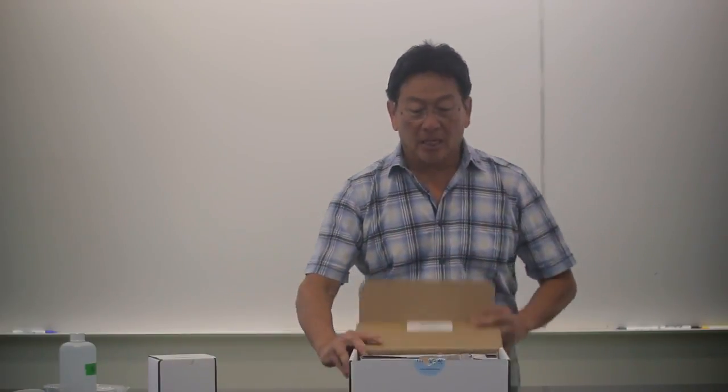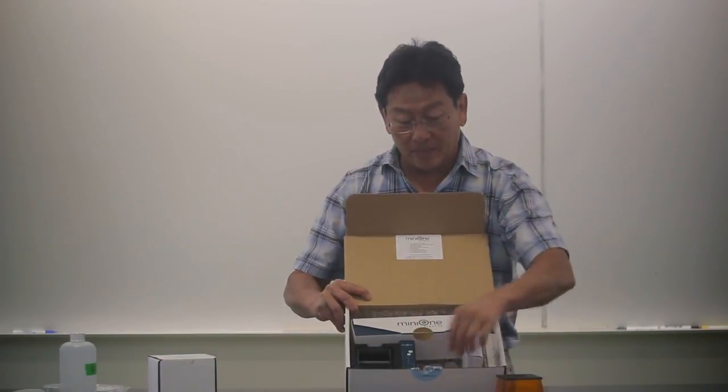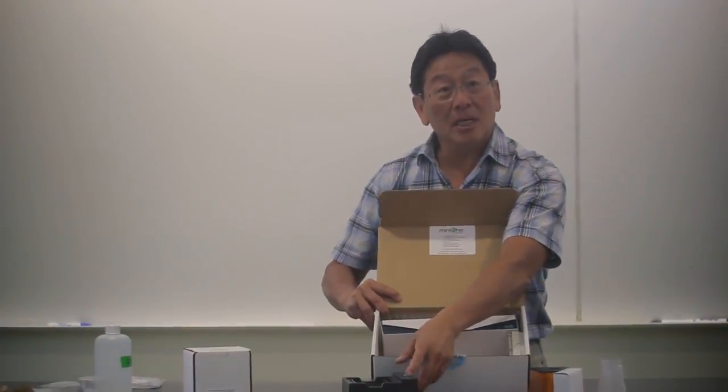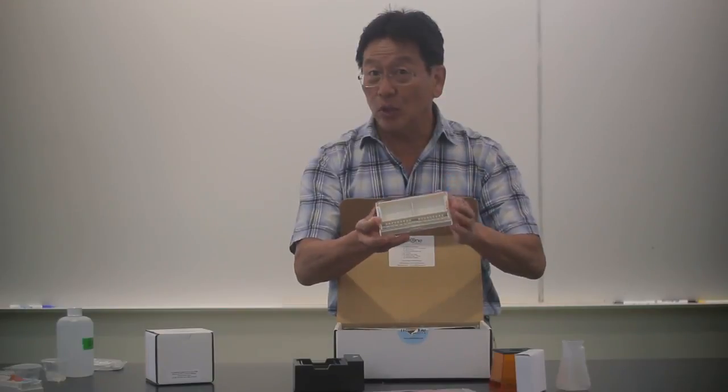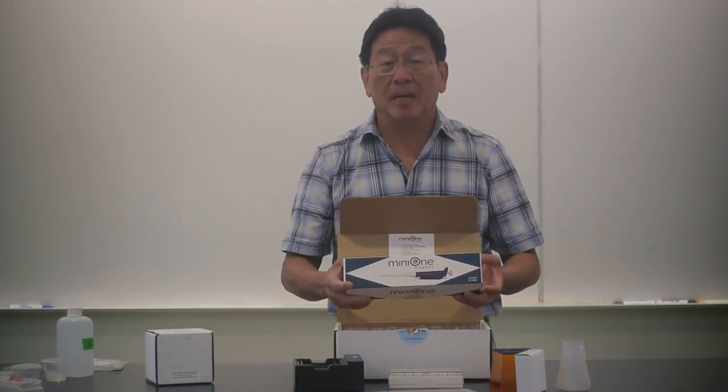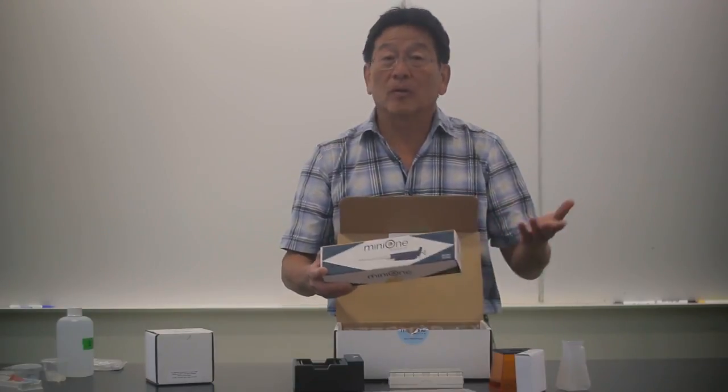So when you open the box inside, it comes with an instruction manual, a little photo hood — you'll see why it's made that way — and a little classic Erlenmeyer flask, your power supply, the running tank, which also contains the illuminator for seeing the DNA while it's running. You also have the casting stand, a cute little bento box, and a 2 to 20 microliter pipette, so that for those who don't have a pipette, it comes with it so you don't have to worry about how you're going to load the gel.